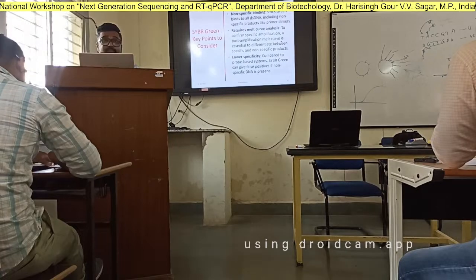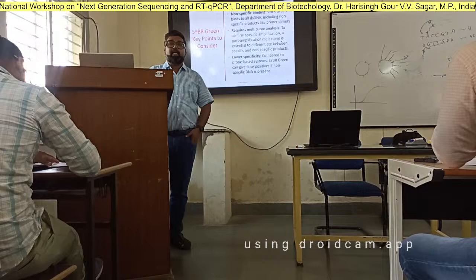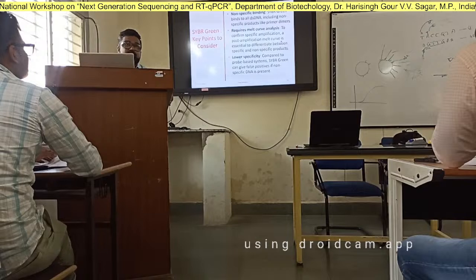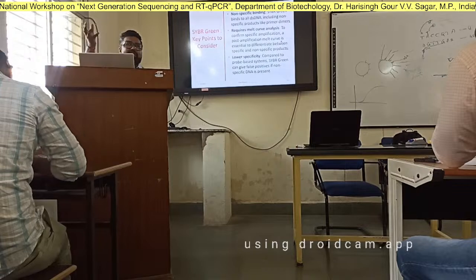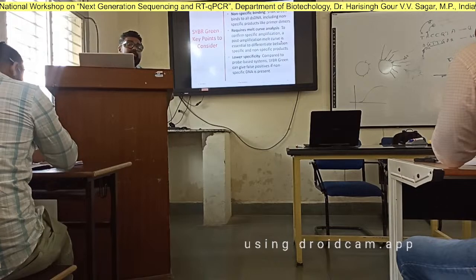Because you can put in a specific target. Suppose you are taking an infected tissue from a human and then you need to check for viral load. And suppose the primer that you have made for your virus, by a fluke chance, also amplifies part of the human genome. It happens due to homology.